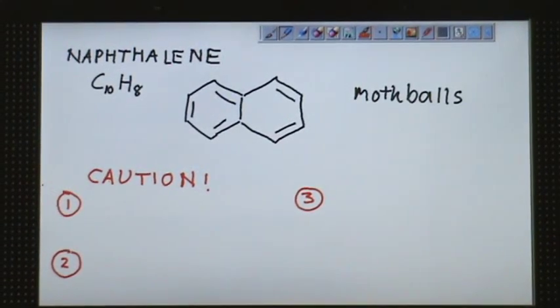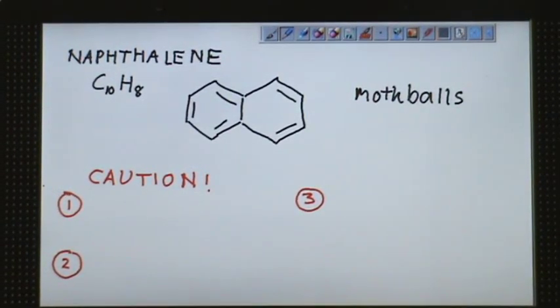In this activity, we want to do some investigation on heating and cooling of naphthalene. Naphthalene has the formula C10H8, and its structure looks like two hexagons. One of the practical applications of naphthalene in our daily lives is mothballs, the one that you put in your dress cupboard to repel insects or cockroaches.